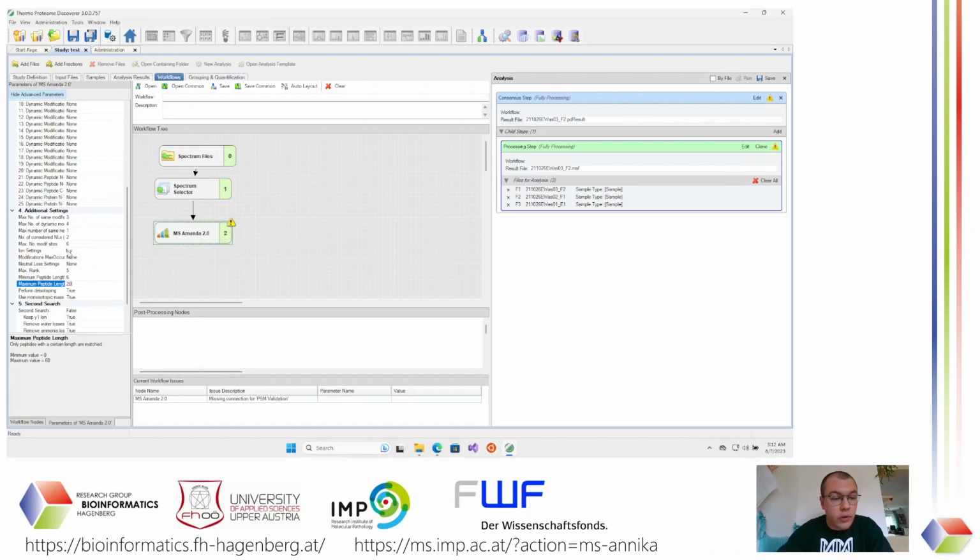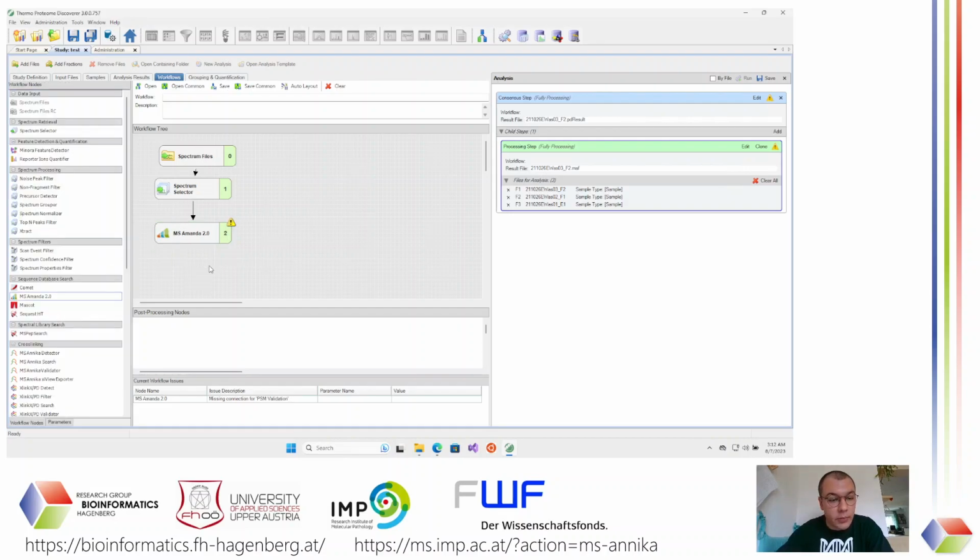If you're looking for any kind of further explanation of the parameters in MS Amanda, please consult the publication of MS Amanda and the webpage, which gives you more details about the specific parameters.